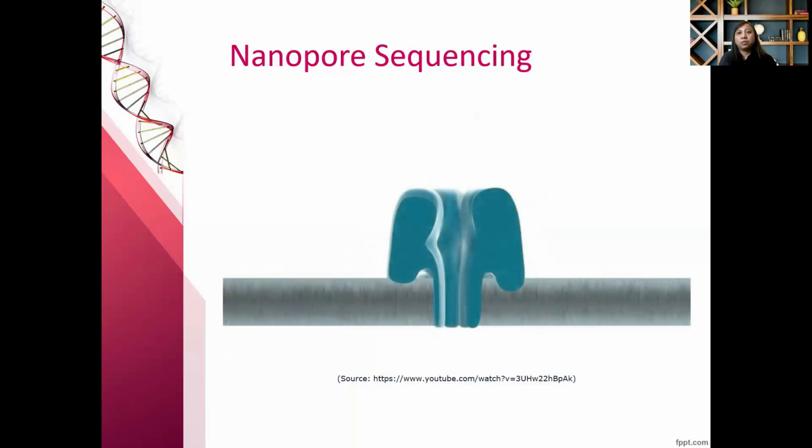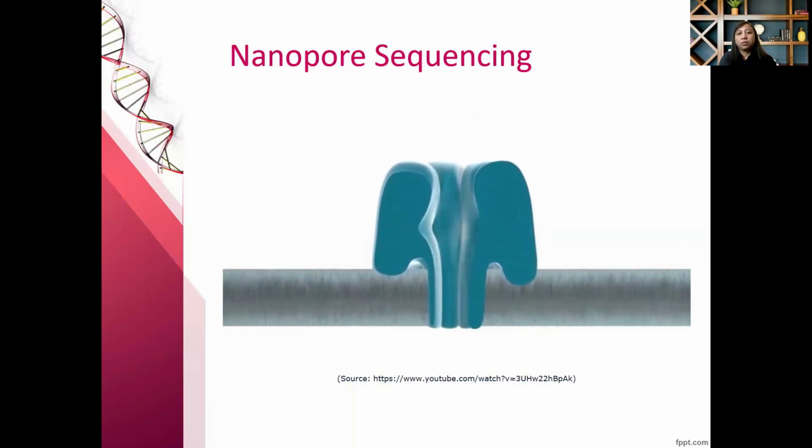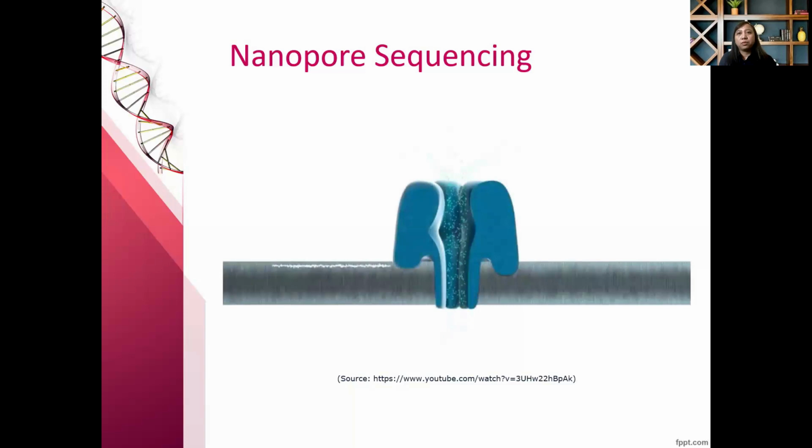In nature, nanopores form holes in membranes. In Oxford Nanopore's system, the nanopore is inserted into a membrane created by a synthetic polymer. This membrane has very high electronic resistance. Here you can see a nanopore piercing a single hole in a membrane made from synthetic polymer. A potential is applied across the membrane, resulting in a current flowing only through the aperture of the nanopore. Single molecules that enter the nanopore cause characteristic disruptions in the current. By measuring that disruption, the molecule can be identified.